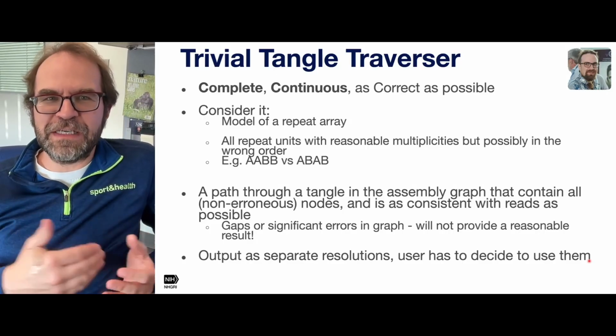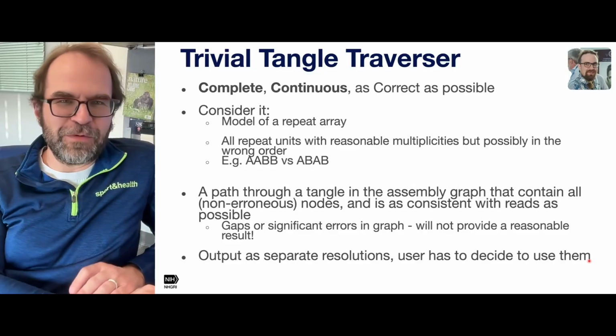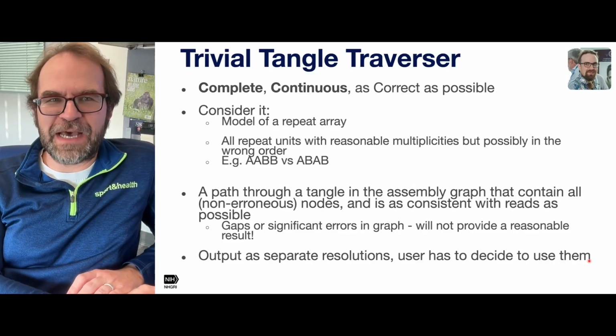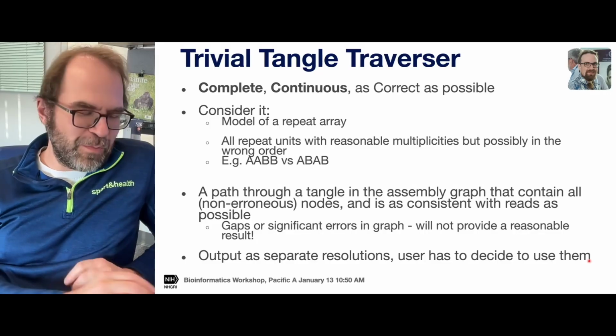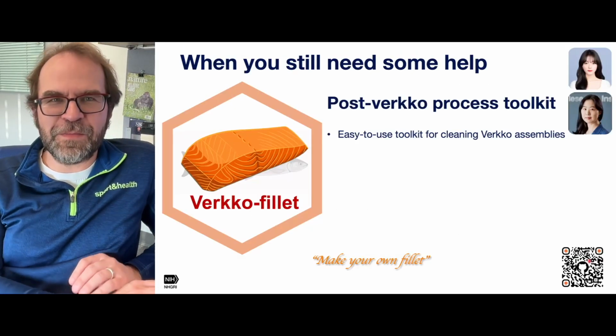So that's why it's a model sequence, but it's an automated tool that will help you resolve these remaining complex gaps. And Dima is going to present it on January 13th at 10:50 a.m. if you want to hear more details about this algorithm.